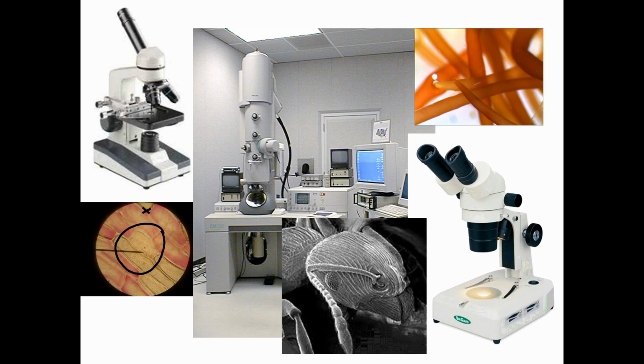Okay, the next type of microscope is the one in the bottom right. Okay, this is a stereoscope. Again, you can look at 3-dimensional objects with this. You won't be able to see cells, but you can see objects that light cannot pass through. Okay, up here, these are some hairs that are put underneath the stereo microscope. So you can get a good close look at them. Things are very interesting underneath the stereo microscope. It's very fun to use, but it just doesn't have the power that a compound scope does.